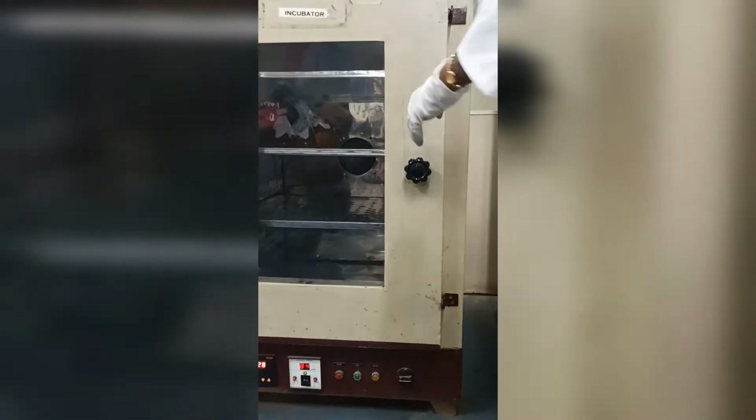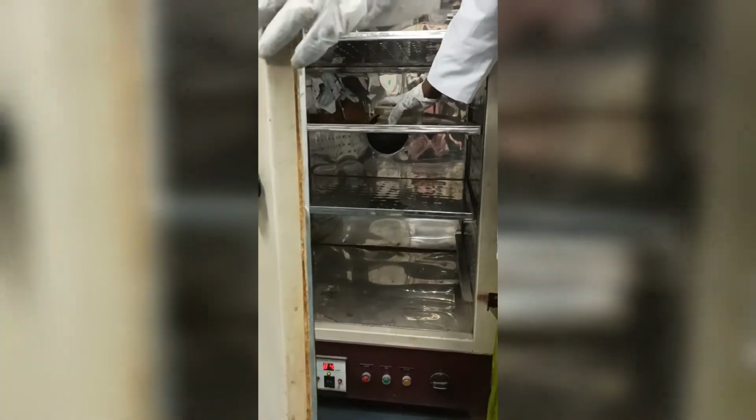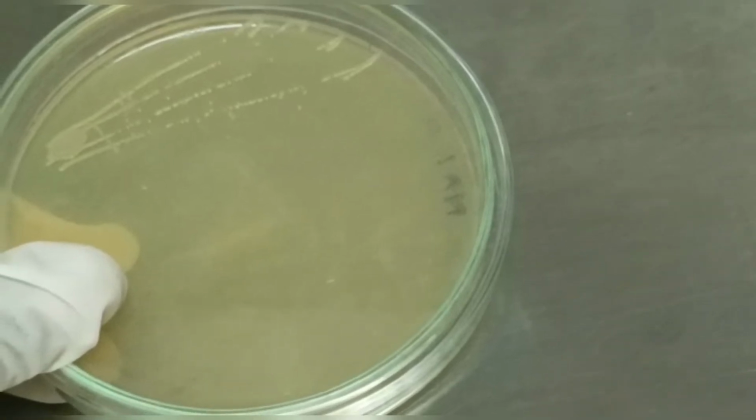After finishing the process, next go for the incubator. Incubate all the plates at 37 degrees Celsius in an inverted position for 24 to 48 hours. After incubation, the isolated colonies are observed in the plates.